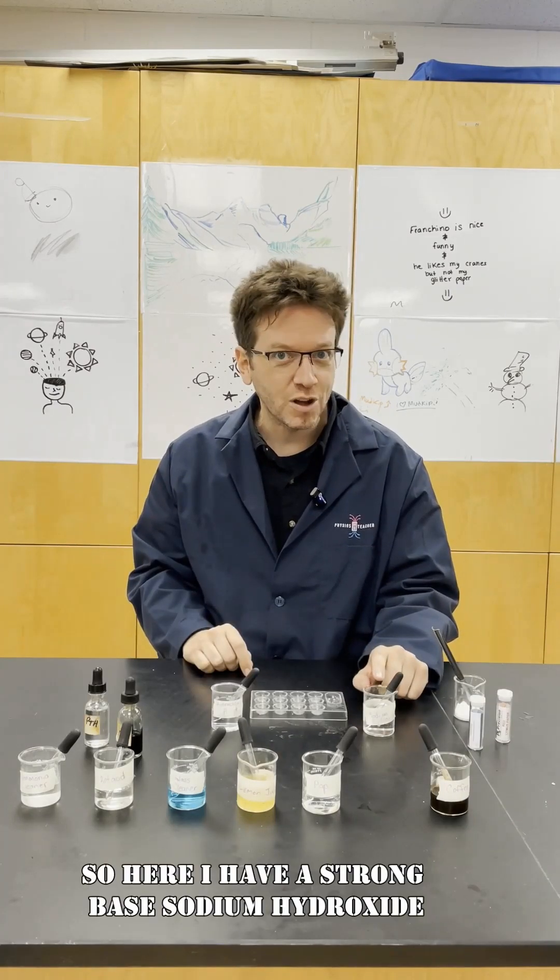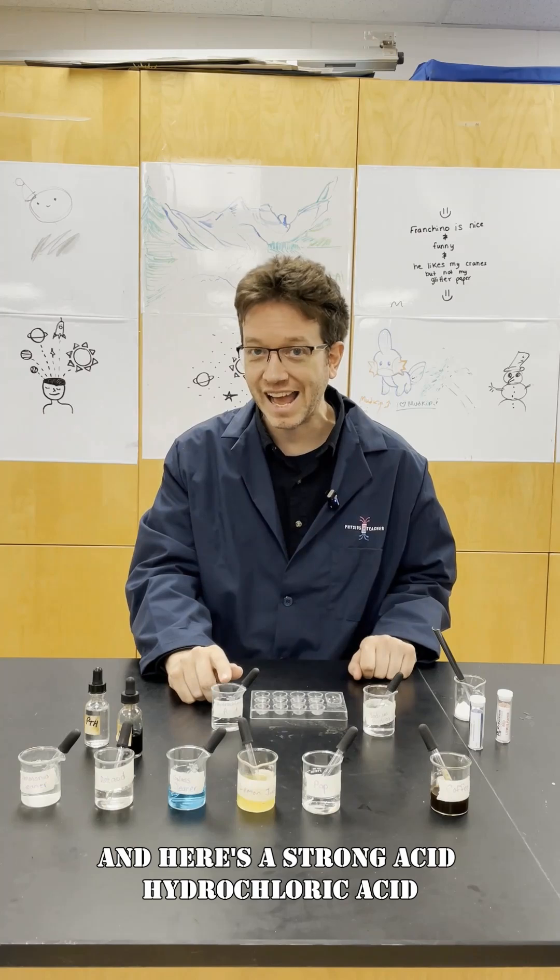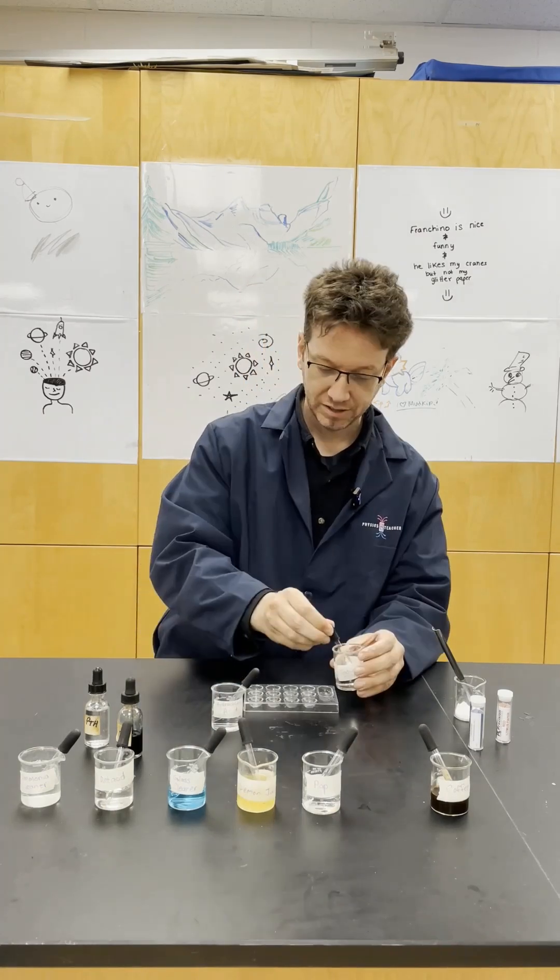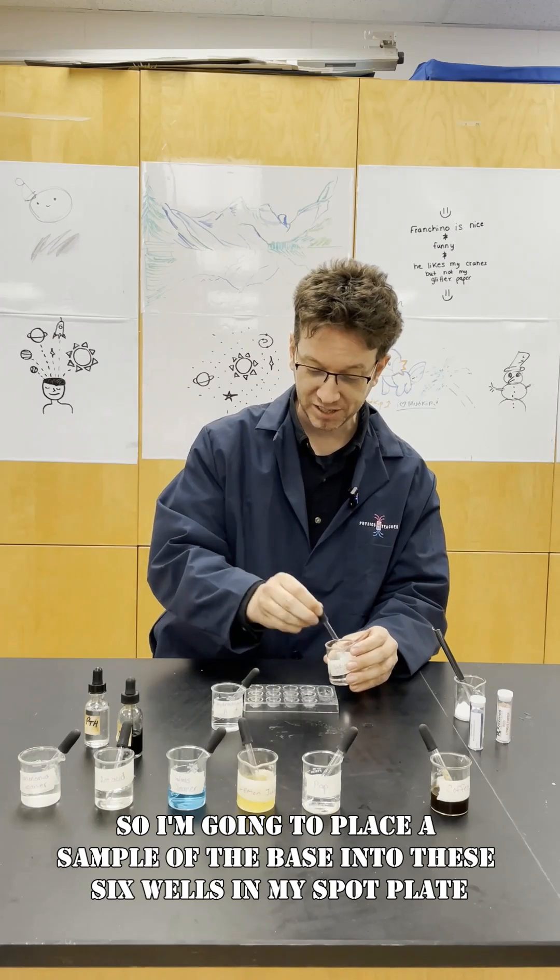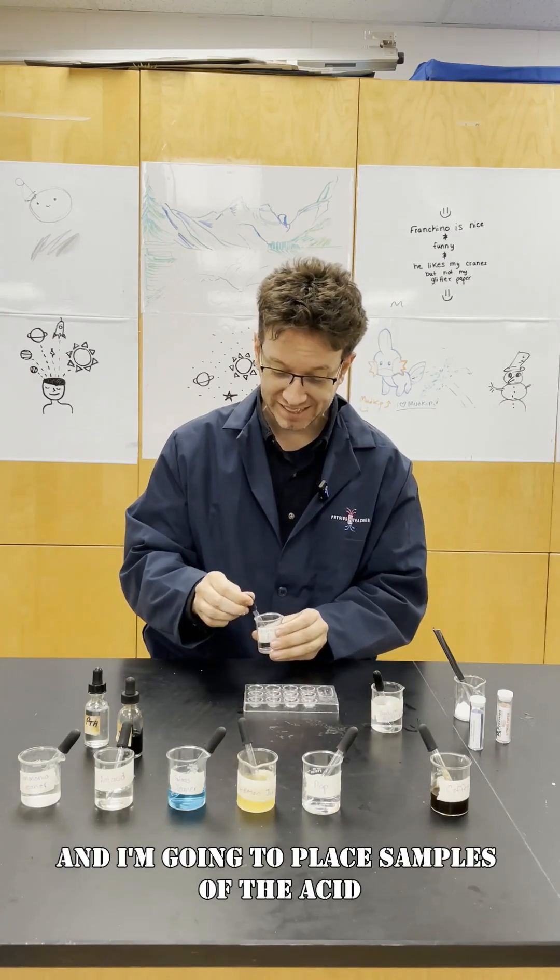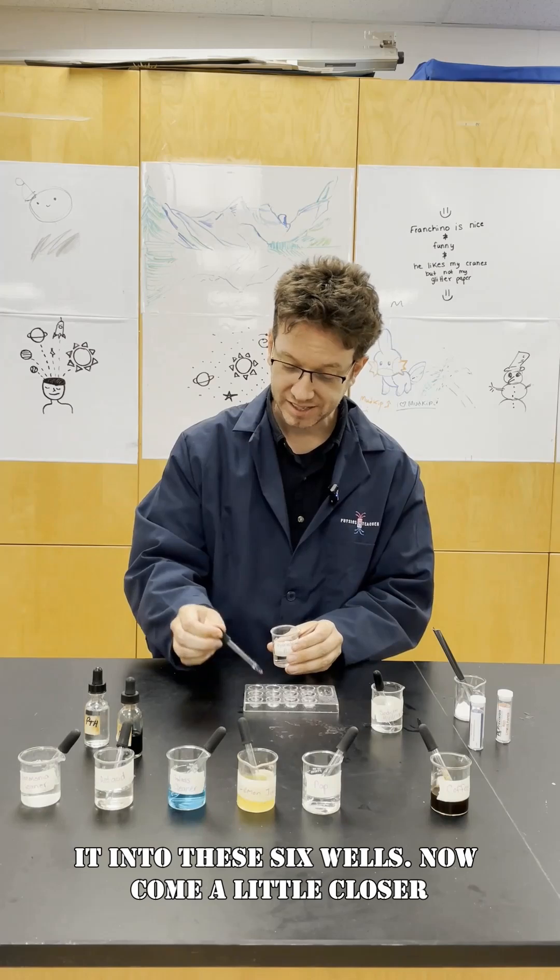So here I have a strong base, sodium hydroxide, and here's a strong acid, hydrochloric acid. So I'm going to place a sample of the base into these six wells in my spot plate, and I'm going to place samples of the acids into these six wells.